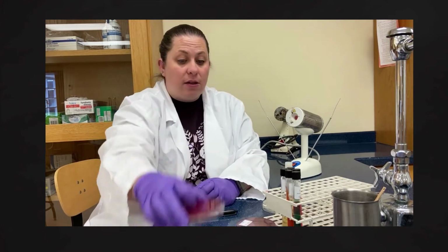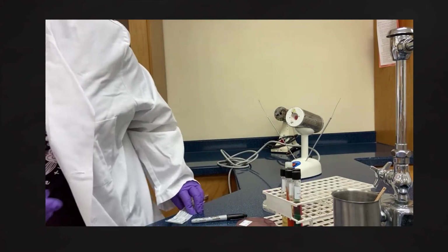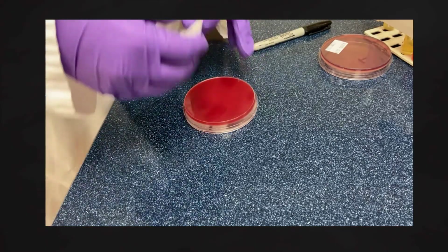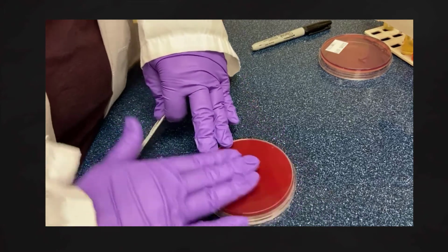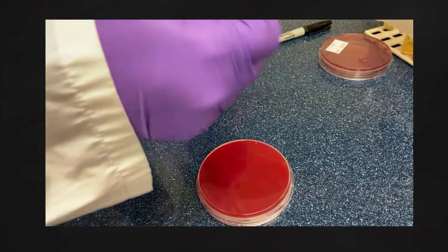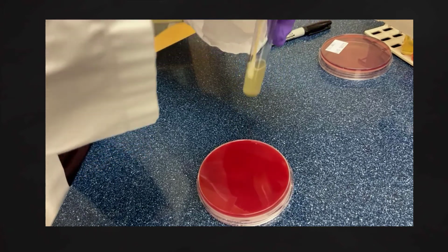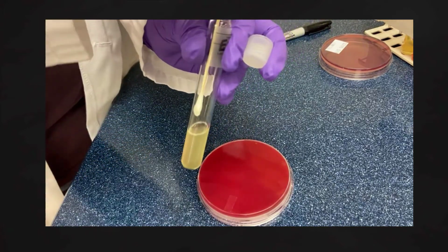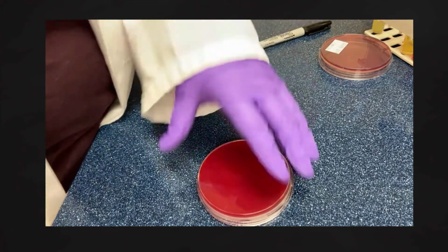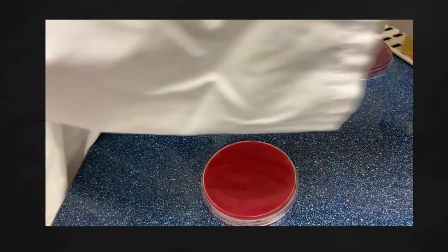So now we're going to take a look at doing the same thing on our sheep agar. All right, so now we're going to do the streak plate where we're going to be putting it into our blood agar. I have a blood agar plate, and I'm going to utilize again a cotton tip applicator, and I'm going to collect some E. coli on it, making sure that I get the excess fluid off by pushing it to the side of the inside of the container. Once we do that, we're going to take that applicator and do one line across the agar, allowing that line to be present.